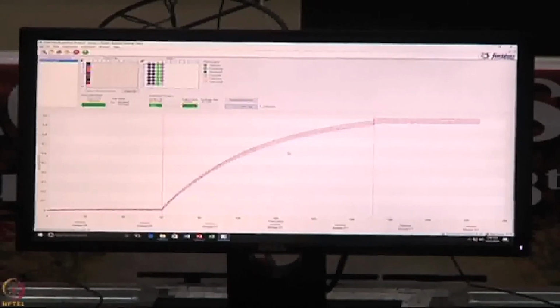The drift probably comes from different components in your buffer systems that play an important role. When you have a protein stabilized with some surfactants or some other components, and you have diluted it in a different buffer altogether when you are doing dilution, that probably sometimes causes those drifts.